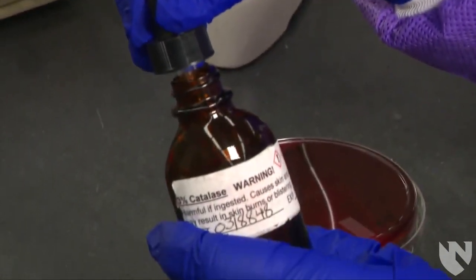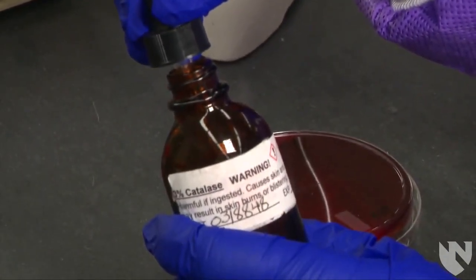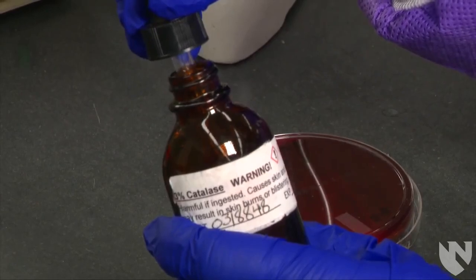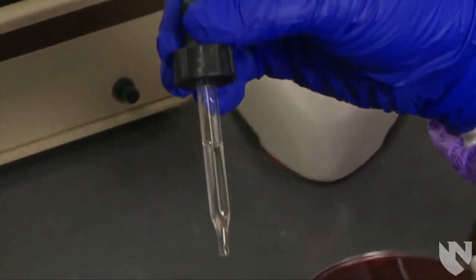Next, using the dropper from the 3% hydrogen peroxide bottle, place one free-flowing drop on top of the smeared bacterial colony.